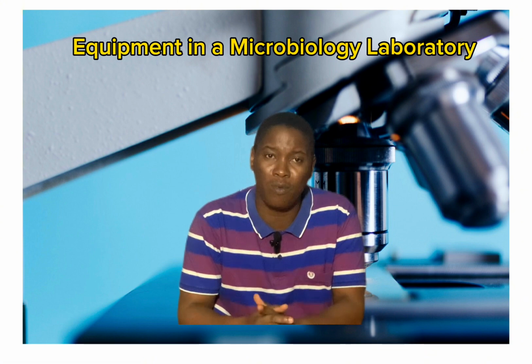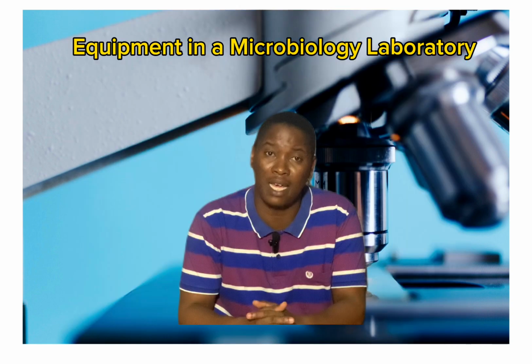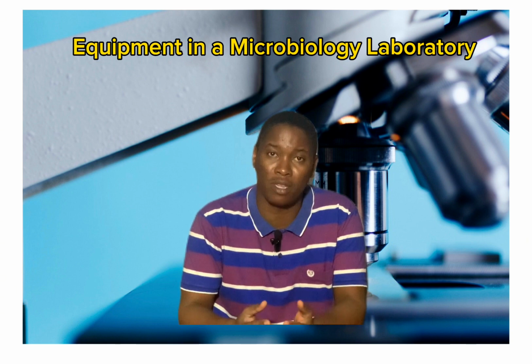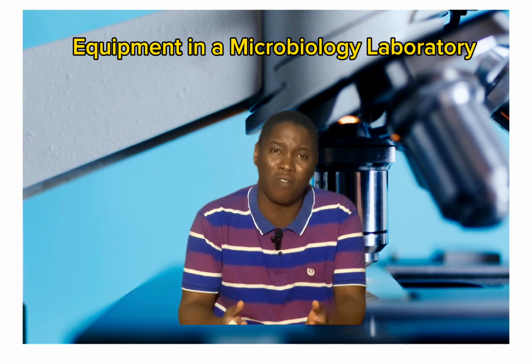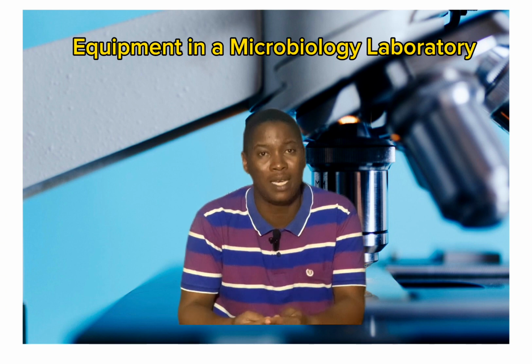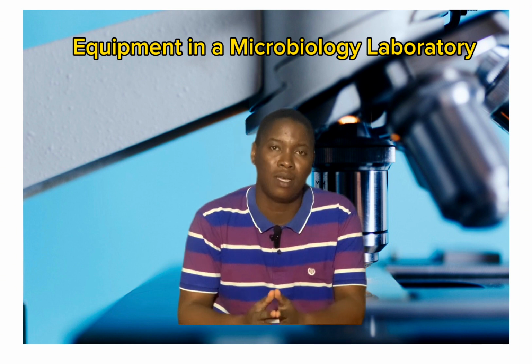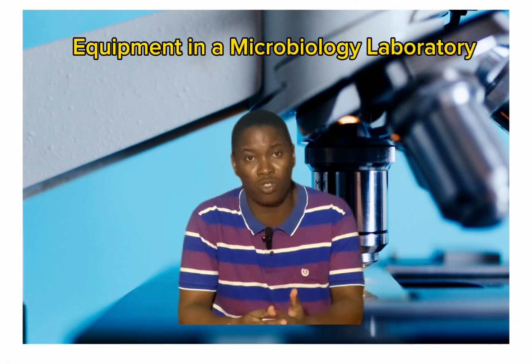Also, in the microbiology lab, we have test tubes. Test tubes are popular and well known in science. They are used in chemistry, in biochemistry. They are also used in microbiology. They are used to hold liquid media. Broth are usually held inside test tubes, and they are also used to perform a lot of biochemical tests. There are a lot of biochemical tests that are performed in the microbiology lab in order to determine the identity of microorganisms. So many of these test tubes are used to run all these different kinds of tests. So test tubes are important.